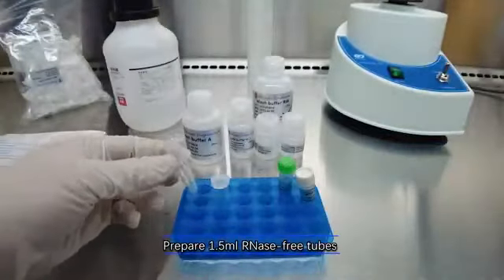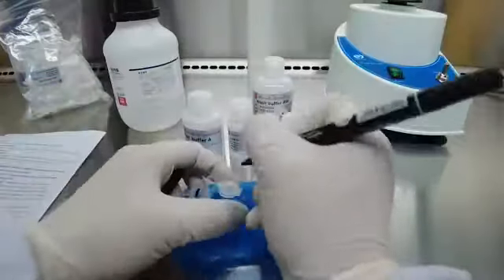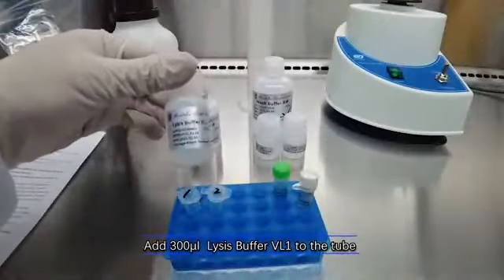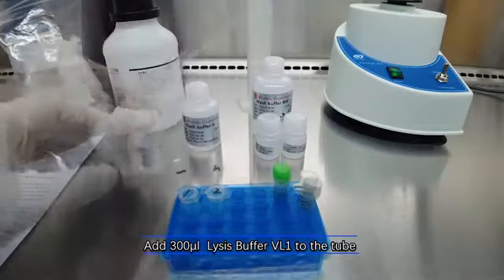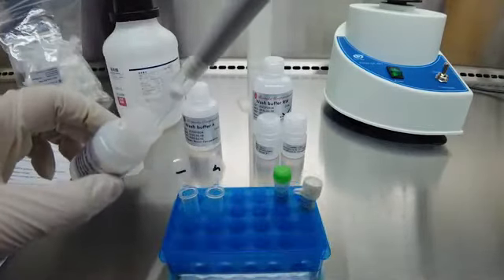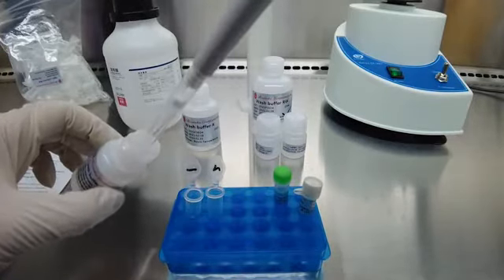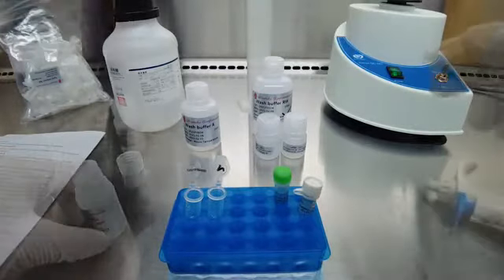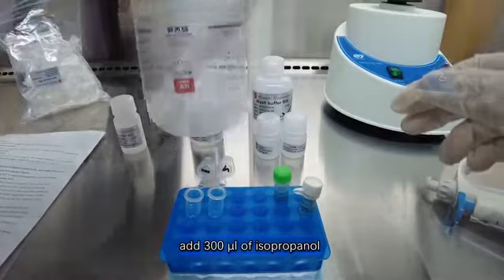Prepare 1.5 ml RNase free tubes. Add 300 µL Lysis Buffer VL1 to the tube. Add 300 µL Isopropanol.